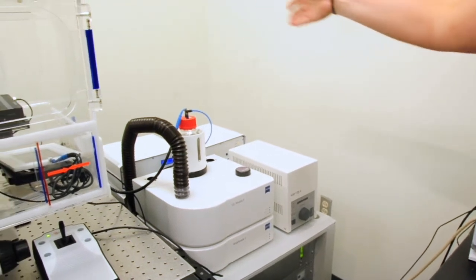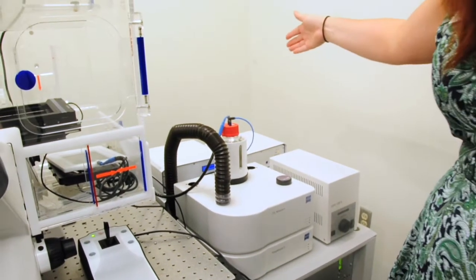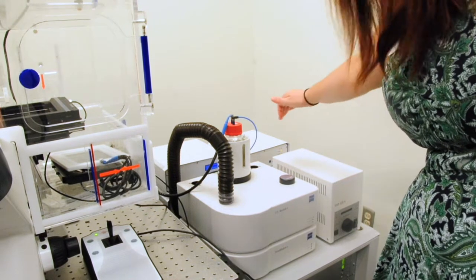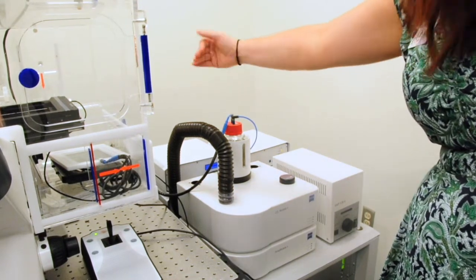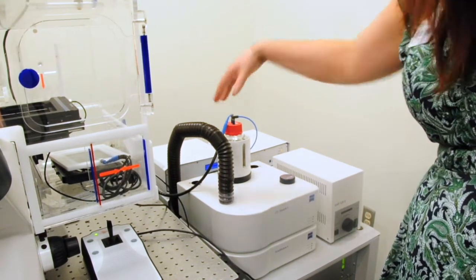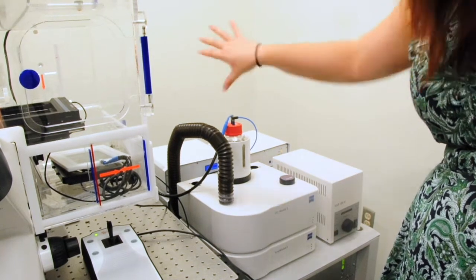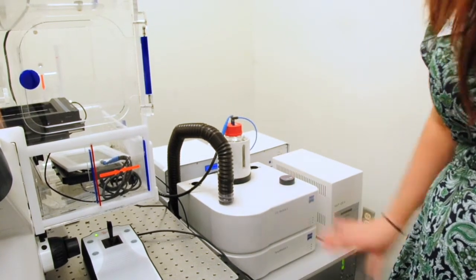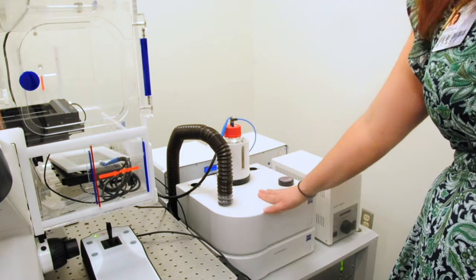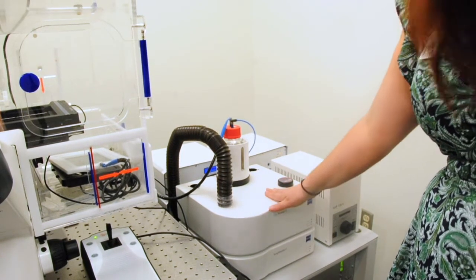Behind it, we have a variety of power sources for our stage as well as for the general system and our definite focus. So those are all generally on, and then depending on if you're doing live cell imaging, is if you turn on this stack right here.